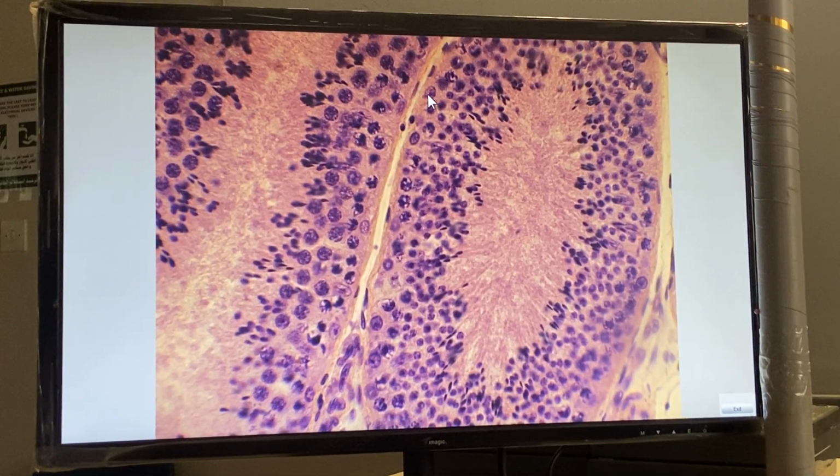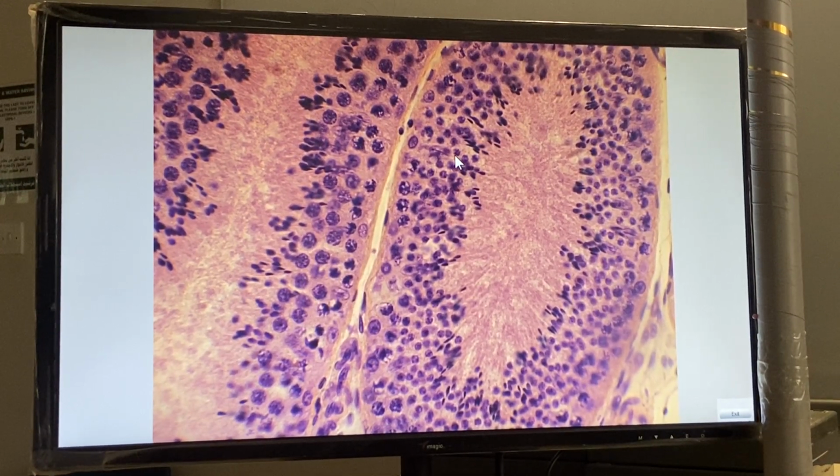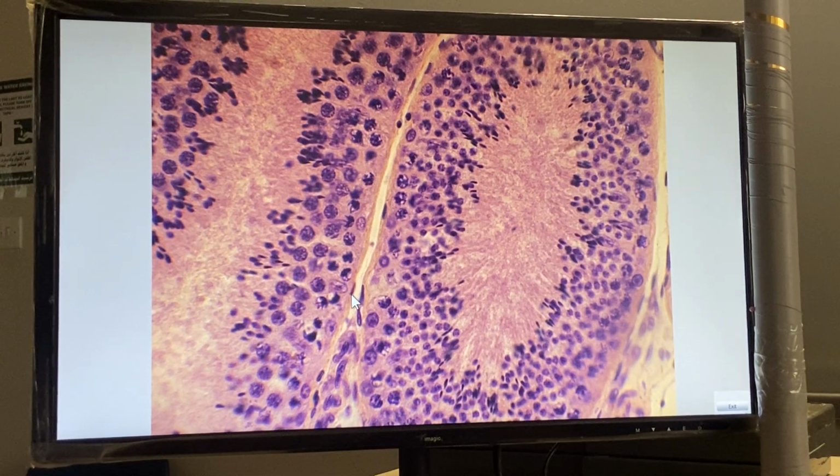Spermatogonia, a primary spermatocyte, early spermatid, and late spermatid. This is the nucleus of myoid cell.